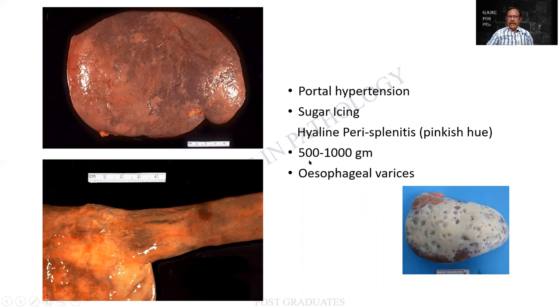There can be an enlargement in the splenic size and weight. It can go up to 1000 grams or even more. And this is the esophagogastric junction in which I am able to see the dilatation of the venules, portosystemic anastomosis, and then there is a dilatation. Obviously these are all indications of a bypass. Whenever there is a disorder such as cirrhosis of the liver, there is going to be a narrowing, and so there is a bypass that is created, and one, there can be dilatation of the blood vessels, there can be bleeding.